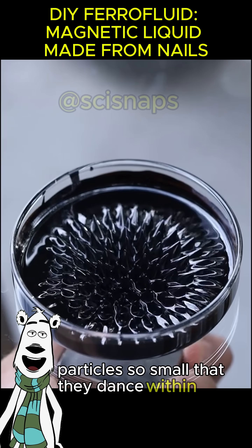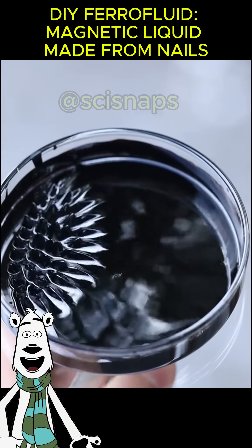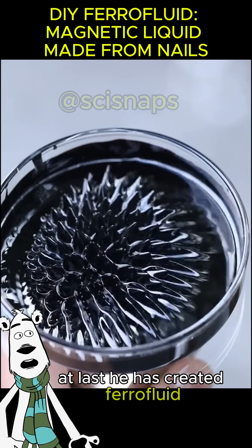The result is a dark, mysterious liquid filled with suspended magnetite nanoparticles — particles so small that they dance within the fluid, yet powerful enough to be pulled by a magnet. At last, he has created ferrofluid.